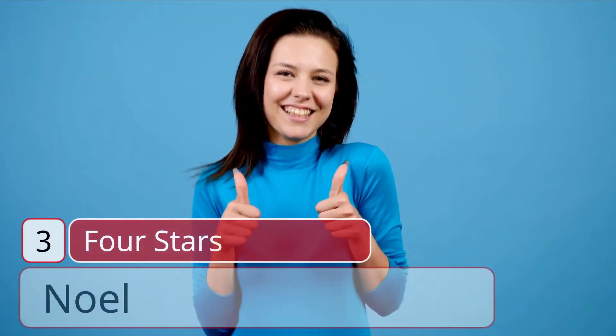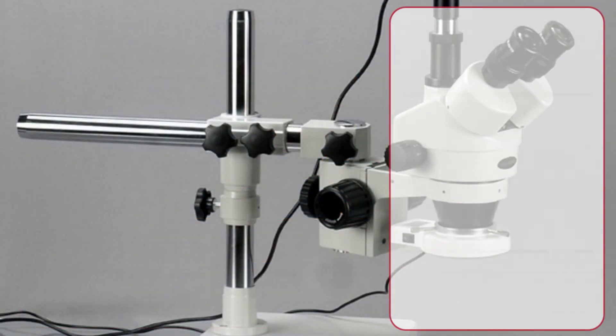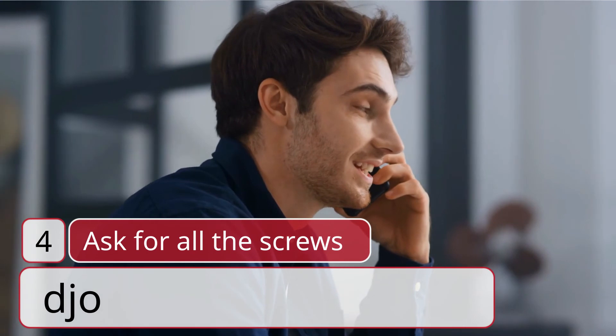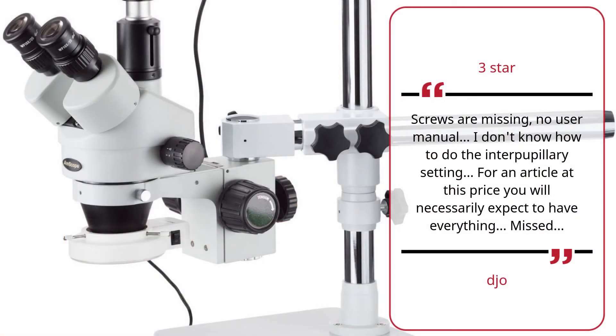Number 3: 4 stars — Noel. Nice, well worth the money. I don't know how to do the interpupillary setting. For an article at this price you will necessarily expect to have everything.